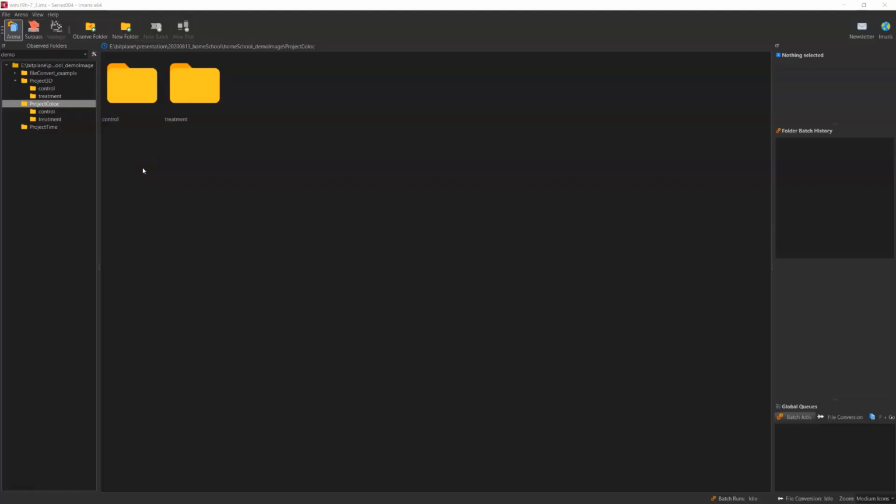Now that we have covered all the basics, including converting the files into IMS format, organizing the data in Arena, setting up the batch parameters, and exporting statistics, now I'll do 2 more advanced examples of batch processing to showcase other features in Imaris that are hopefully useful for your projects as well.